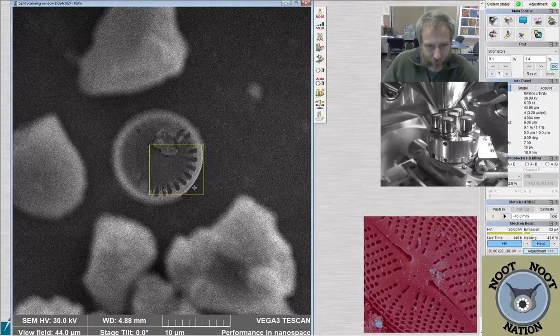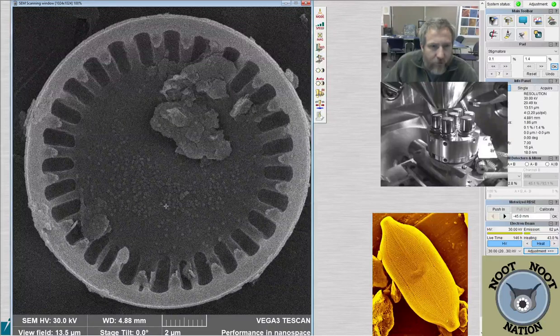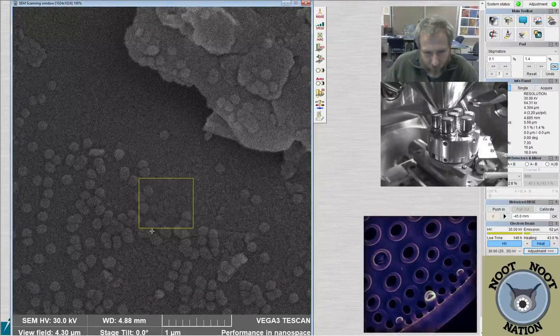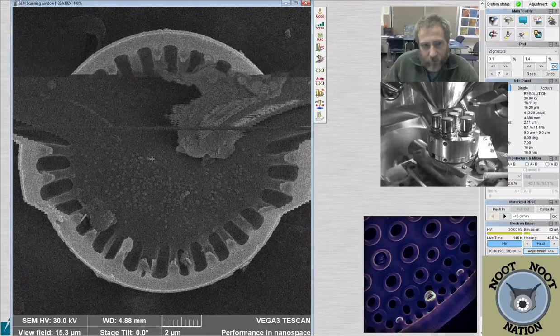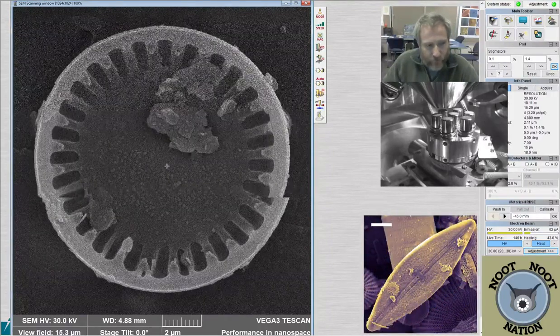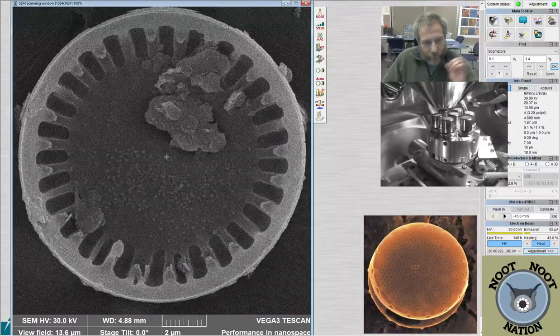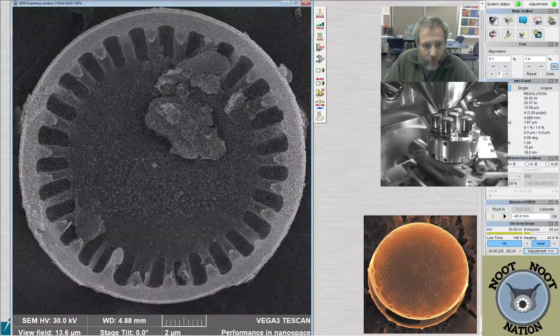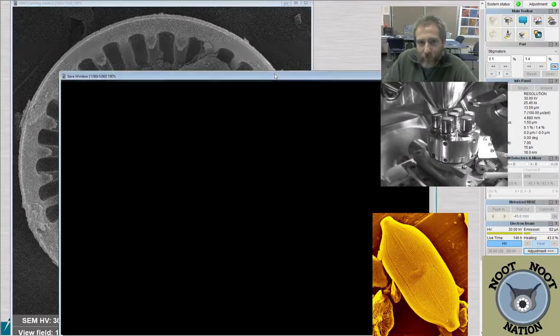It's Cyclotella meneghiniana. So let's zoom in. We'll get a nice high magnification focus somewhere in here, and then I'll just zoom back out a little bit. One nice thing about the SEM is if I get it in focus when I'm close, it stays in focus when I zoom out. So you can get it really sharply in focus when it's this little tiny area, then the bigger image is always going to be in focus as a result. Okay, let's just go with this one. Got a nice clean image. A little bit of junk on it, but that's just normal for our river setting.